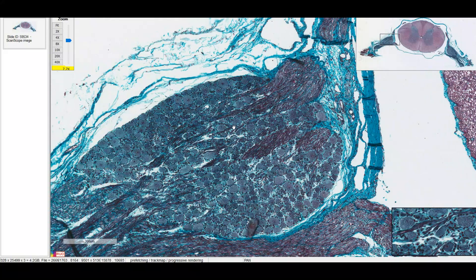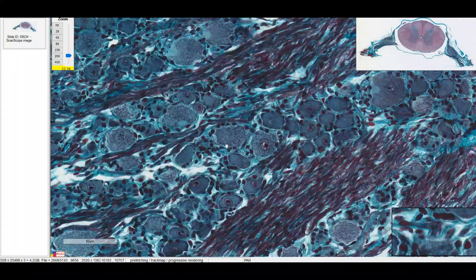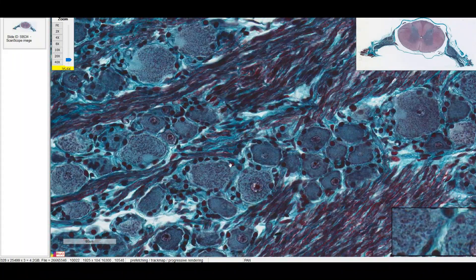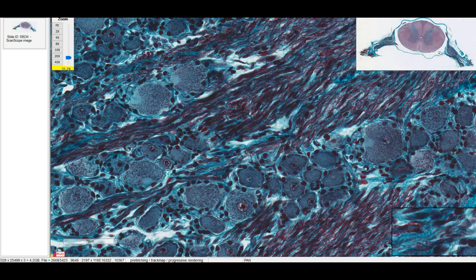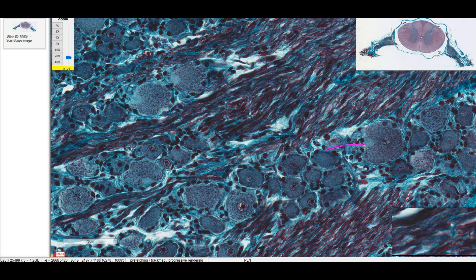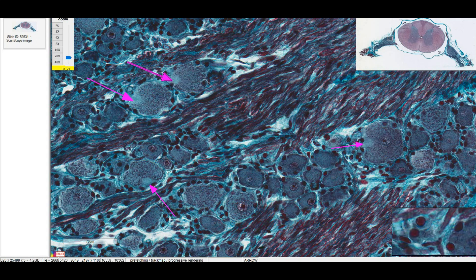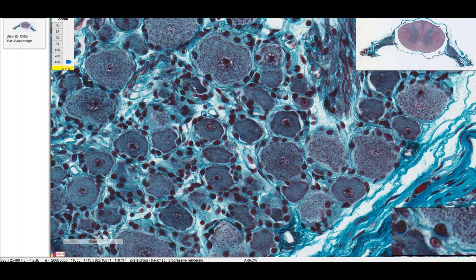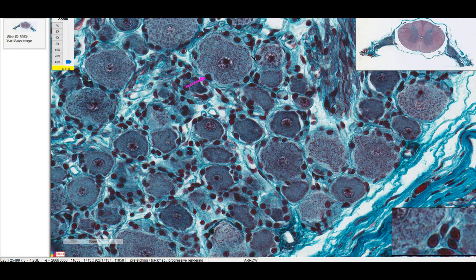The DRG is a good place to look for some axon hillocks as well. Remember we're looking for spots that don't have granules. So it looks like these are probably the axon hillocks of their neurons. Another thing to point out here are these satellite glial cells. Their job is to provide nutrients for the neuronal cell bodies.